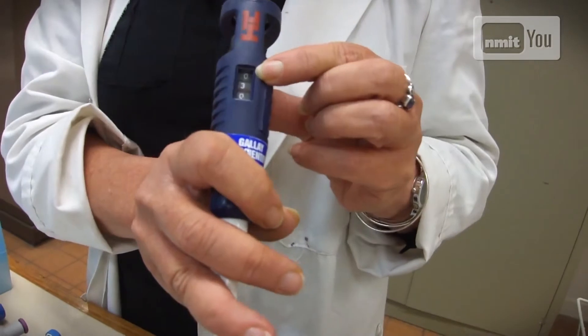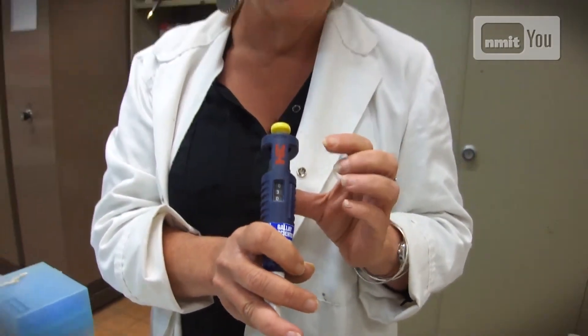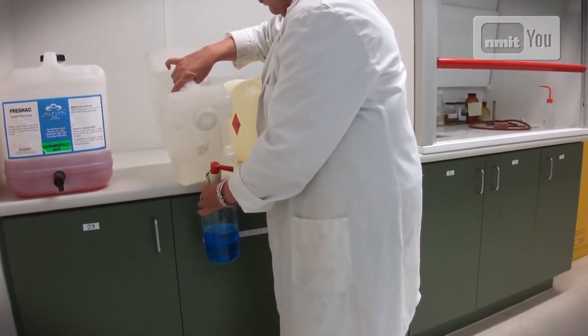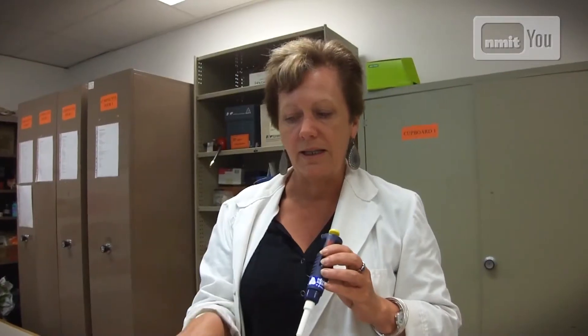We find a lot of students find that hard. It's not like just simple measurements, because we're talking about minute amounts of liquid. That's why I've used coloured water this time — normally they would be using clear liquid, but at least they can see it go up into the tip, otherwise they wouldn't be able to tell. So we use coloured water to teach them how to do it, and then afterwards they'll be able to use it correctly.